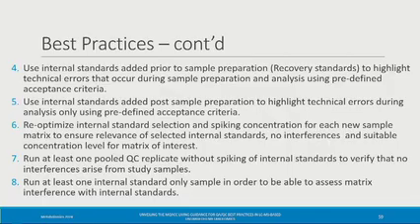And that is the main missing point. They describe that they use these internal standards, but how? Around 80% of the papers that I have read do not describe it exactly. But I would be happy to see that many of us were reviewing papers asking this from the authors. That would, I think, enhance the quality of understanding. Thank you.